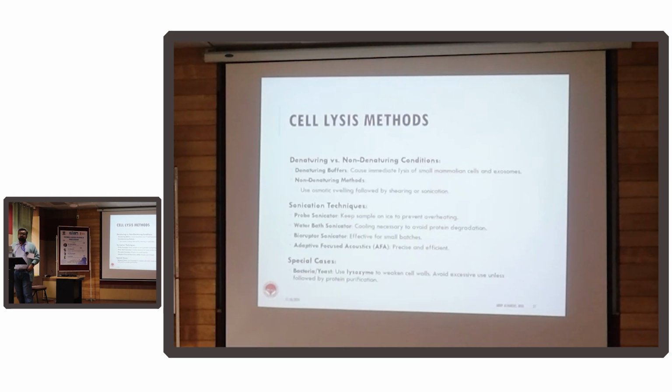Also, you can use sonication, strong sound waves, ultrasonic waves. They will disrupt the cells. Whenever you use sonication, always remember that it generates lots of heat. As we discussed in the first part, for most of the samples that you process, you have to avoid heating the sample. Don't heat the sample, because if you heat it, the integrity of the sample is gone.